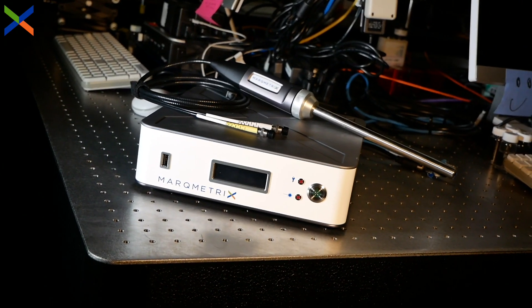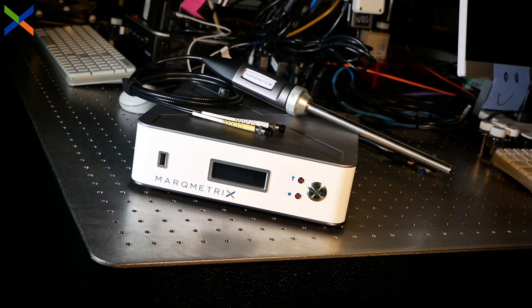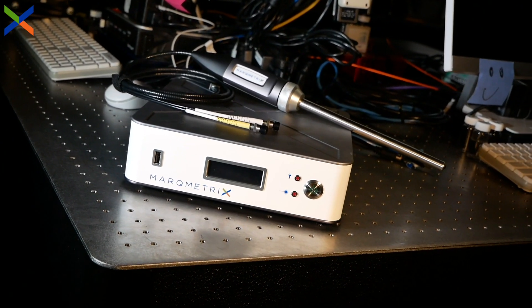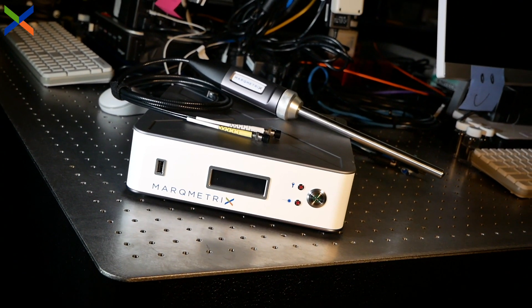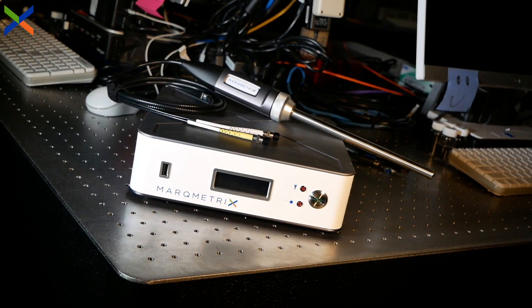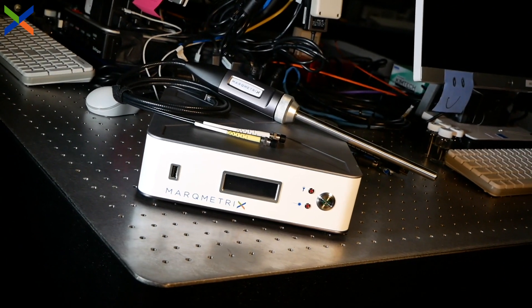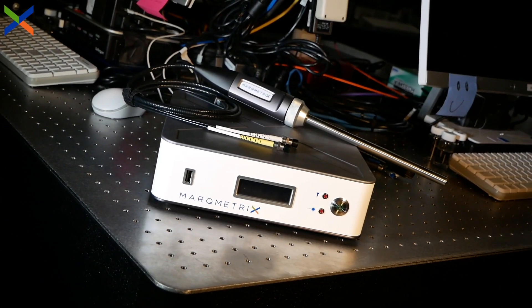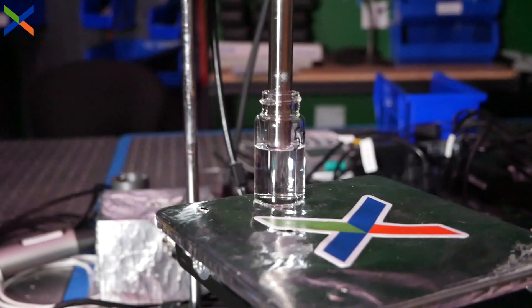In previous videos, we've explored how easily and quickly users can acquire data-rich compositional information with a MarqMetrix all-in-one Raman system.